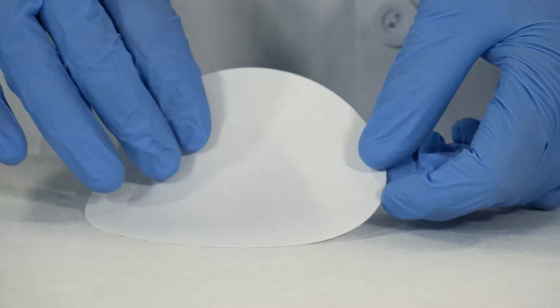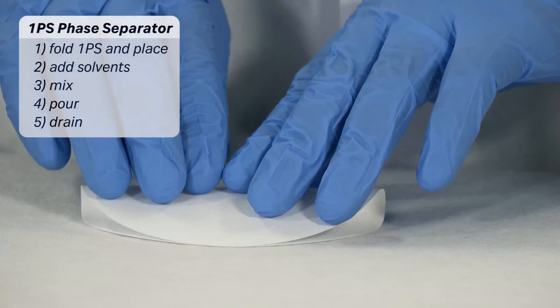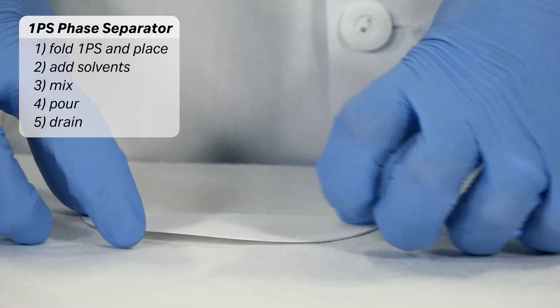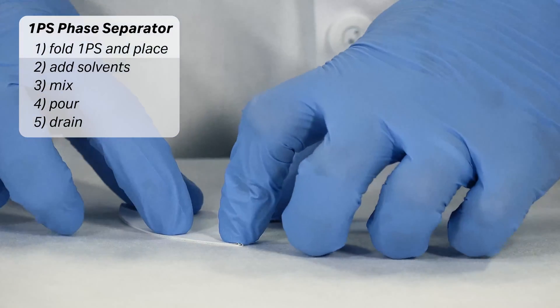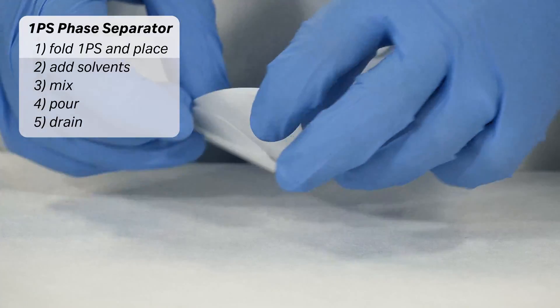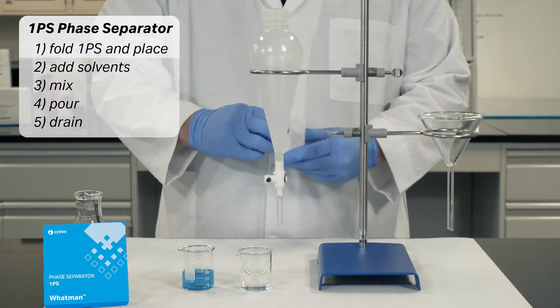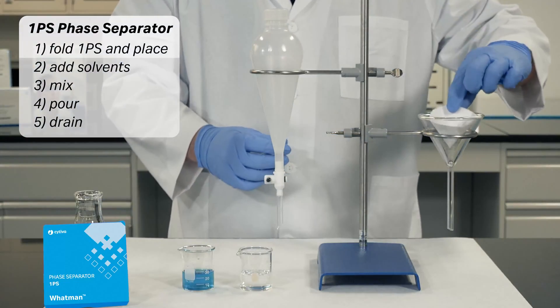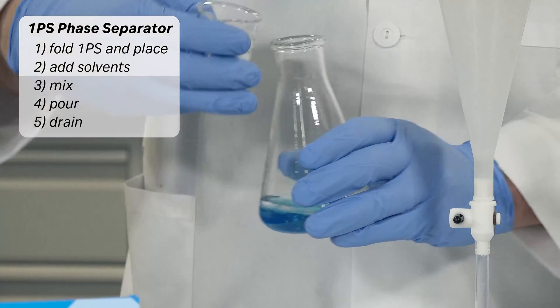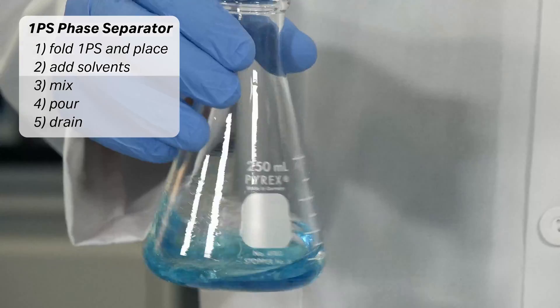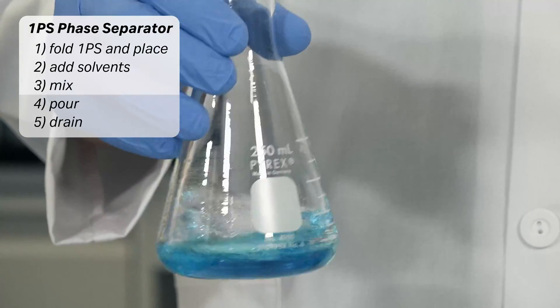Now, let's switch to the Whatman 1PS phase separator papers from Cytiva. Fold the 1PS phase separator paper into a cone and place into the glass filter funnel. Add equal amounts of an aqueous and organic solvent to an Erlenmeyer flask. Mix by swirling several times.